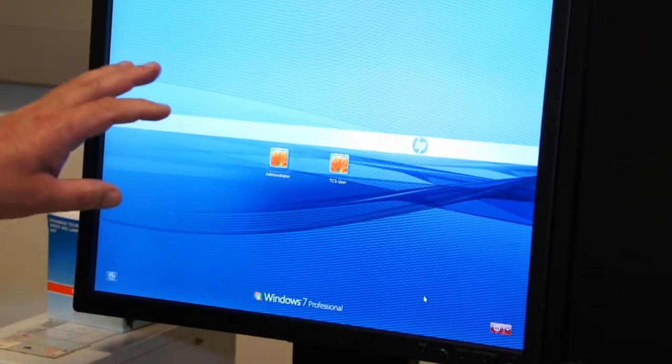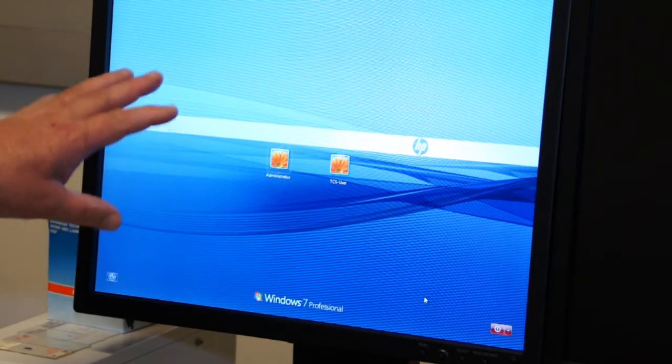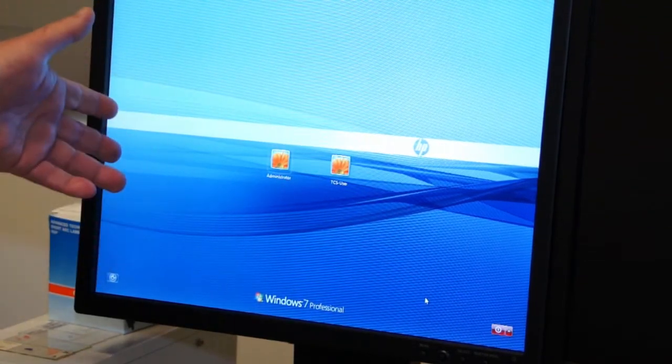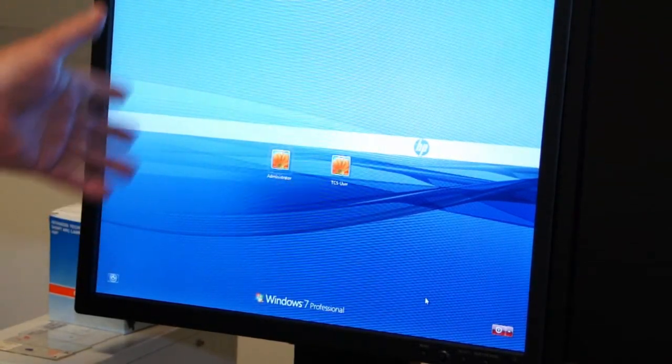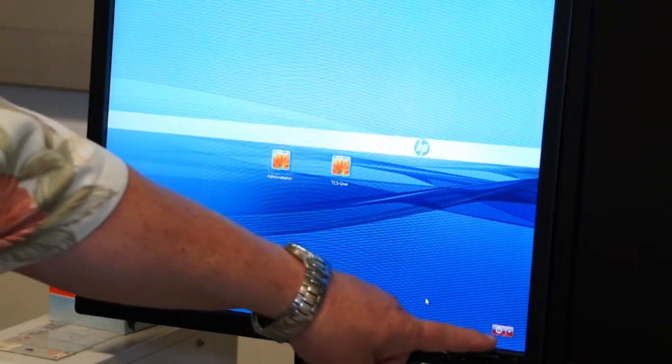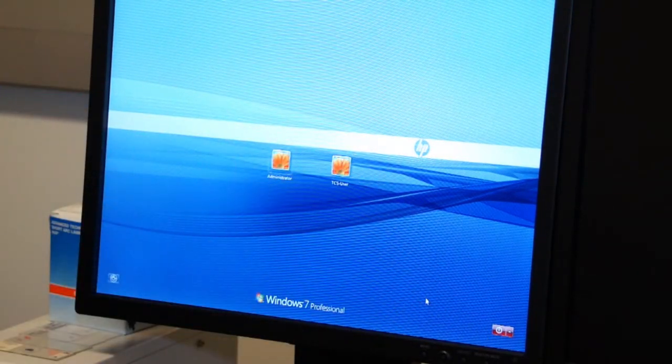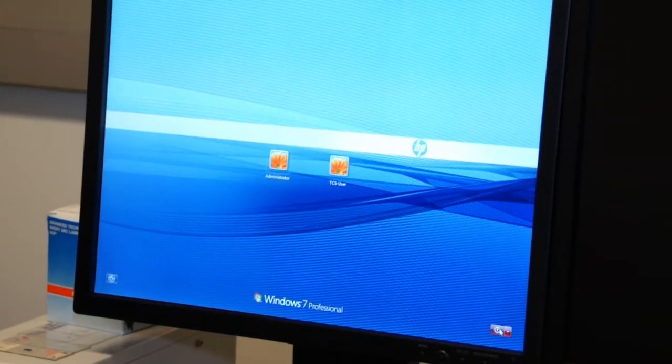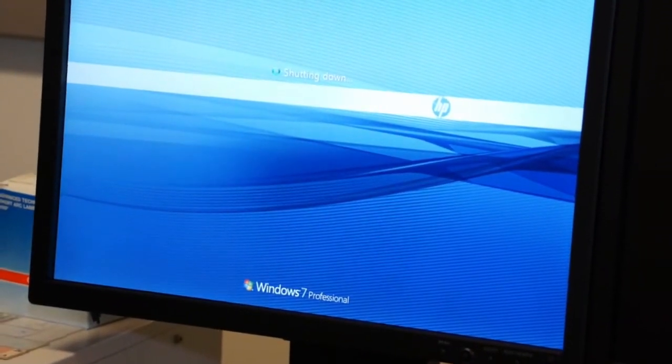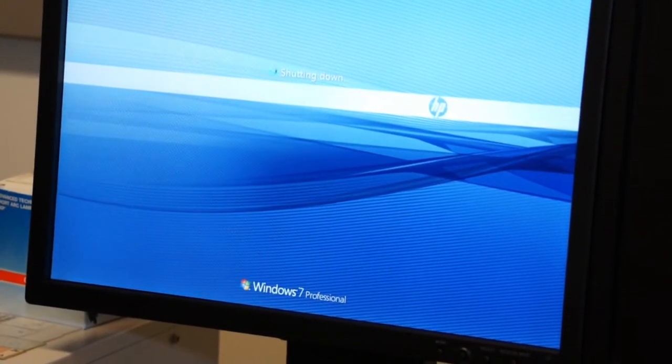Because the main power to the system also turns on the computer, Windows starts by itself. Therefore in shutdown you must first close Windows before you can turn off the power to the system. So we close Windows and we wait until Windows shuts down completely.